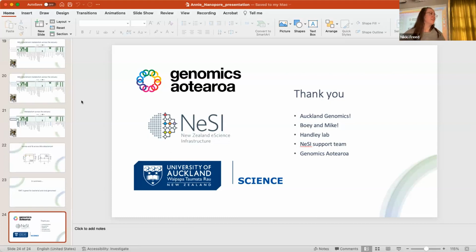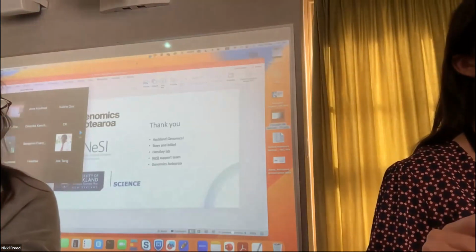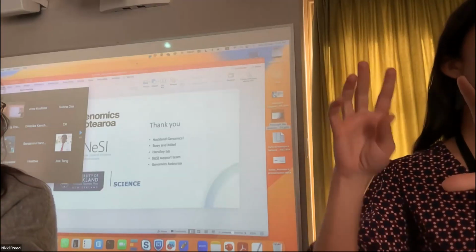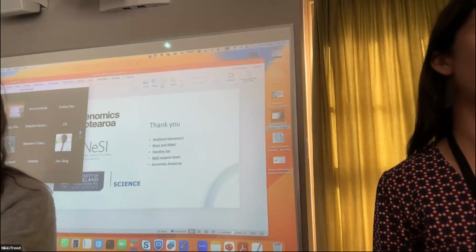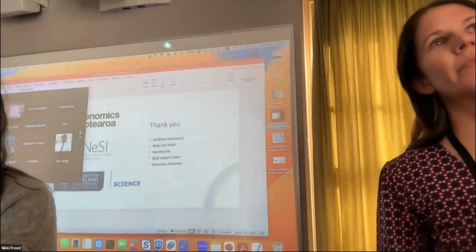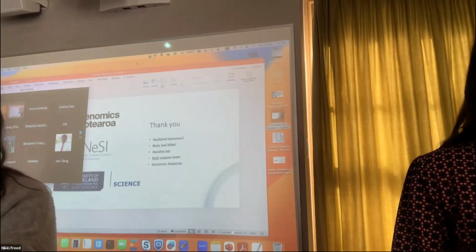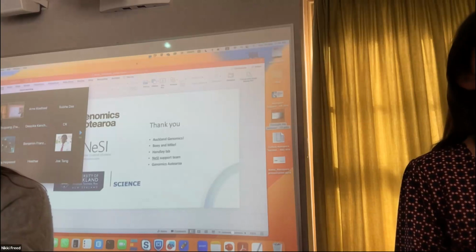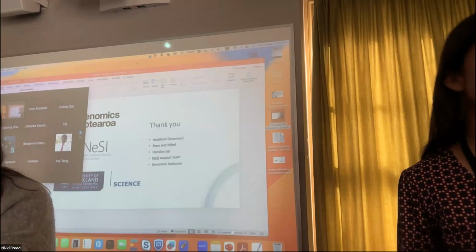What we're trying to do with most people's data is use high accuracy base calling in real time while we're sequencing. Because the computer can't keep up in real time, we then move the data to Nessie, do super high accuracy base calling, and deliver all of that. I'd use the medium option in real time and then do the high quality; it depends on what you need. You need a pretty good computer to do super high accuracy from a PromethION flow cell generating a lot of data.